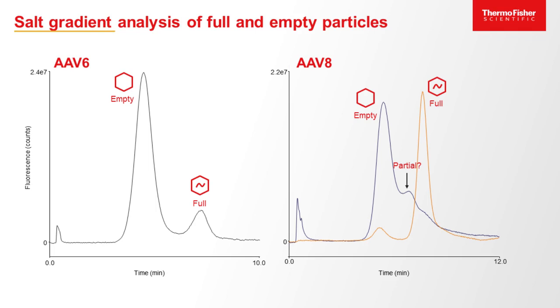And you can see for the AAV8, we were able to separate a little bit more than just empty and full. I do not know exactly what that middle peak is. Maybe it's partial, maybe it's broken particles. We don't know, but we were happy to see that we separated something more than even empty and full.